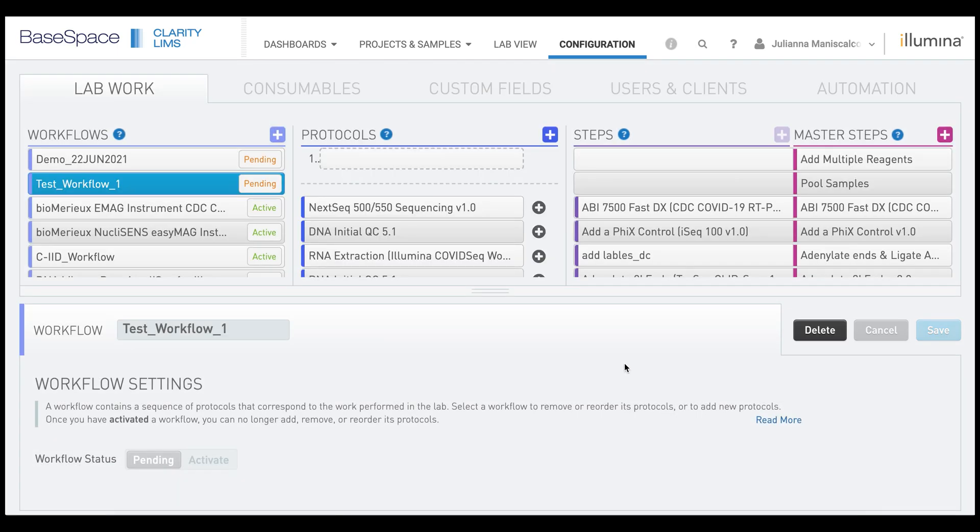After you click Save, the workflow will have a pending tag next to it and you will see under the protocols column there is now a dashed line and a one with a dashed box next to it. We are now ready to start adding our protocols to this workflow.